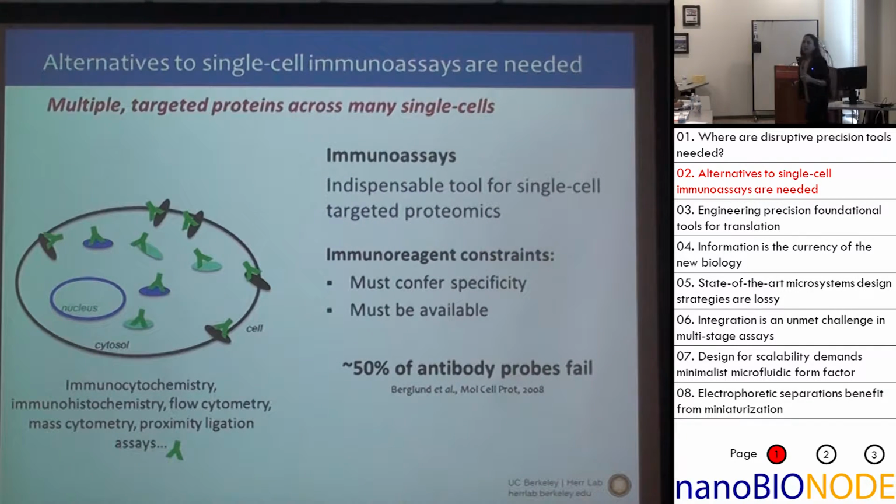Okay? You know that your measurement for your protein is only as good as the antibody you're using as the probe, right? And some of the big issues with the antibodies are sensitivity, so being able to get enough binding so you can read out low levels of protein, but also something that we call the analytical specificity. If that antibody recognizes off-target proteins and reports a positive signal, you have no idea how much of that signal comes from your target of interest and how much of it is what we call cross-reactivity, right, or off-target signal.